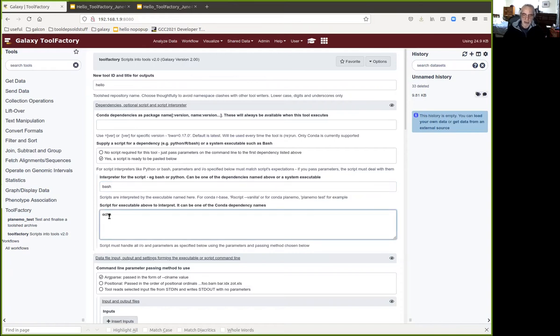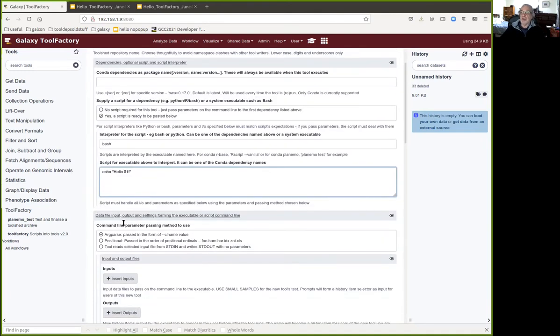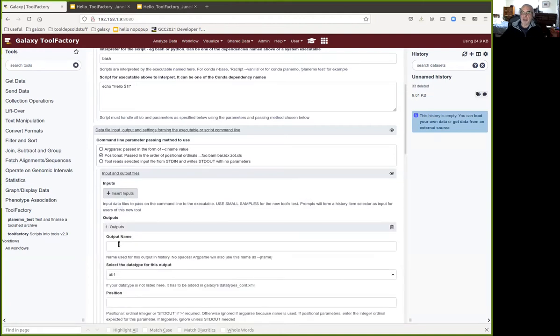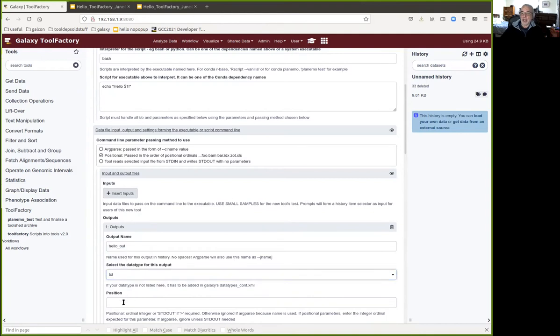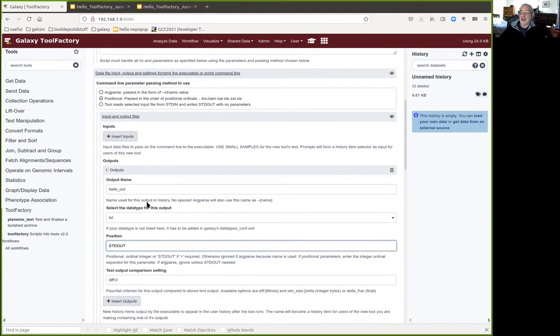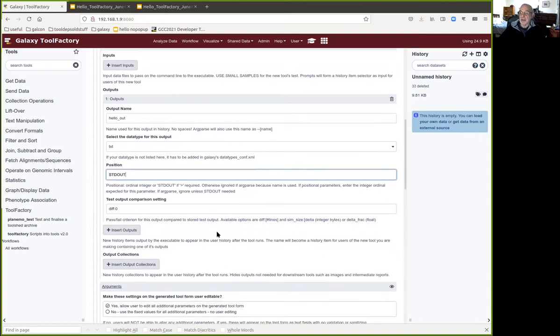The script will be: echo hello $1 with an exclamation mark for added bonus points. The Tool Factory asks how you want to pass command line parameters — we need positional parameters. In the input section, we don't need any input files from the user's history. We do need an output file called 'hello_out' of type text. For position on the command line, we're going to use a Tool Factory trick: put STDOUT, and the Tool Factory will take the output from your script and put it into this output file in the user's history.